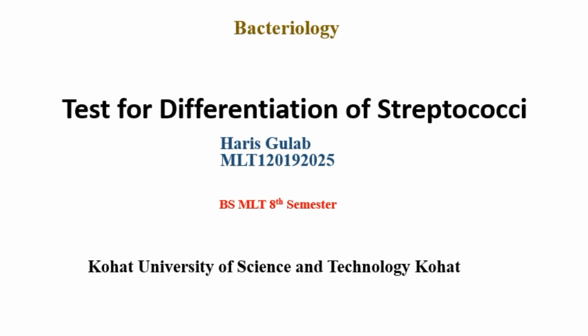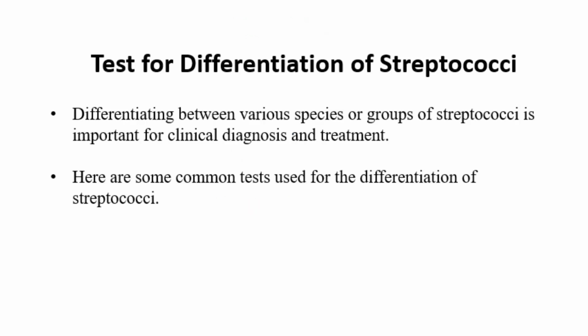MLT12019 and 2025. Today, my presentation topic is test for differentiation of Streptococci bacteria. So, I will discuss different tests used for the differentiation of Streptococci bacteria in the coming slides. Test for differentiation of Streptococci.